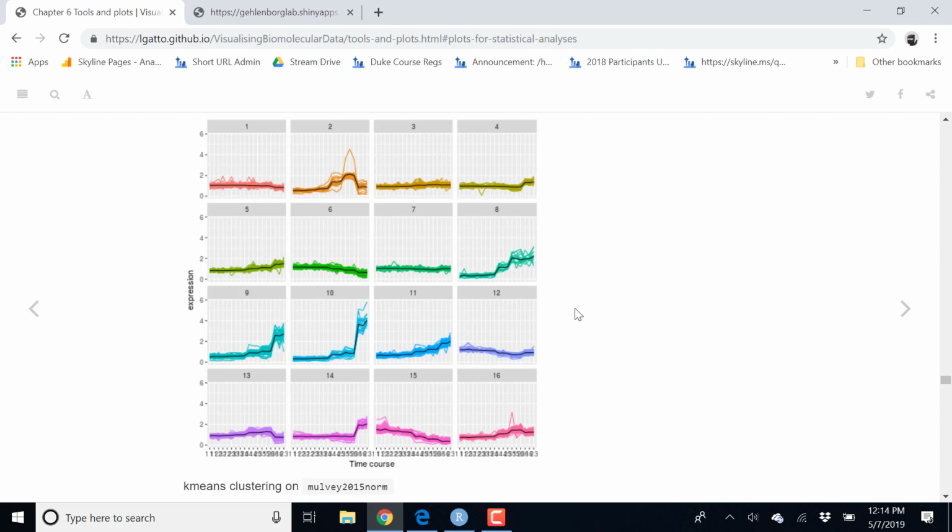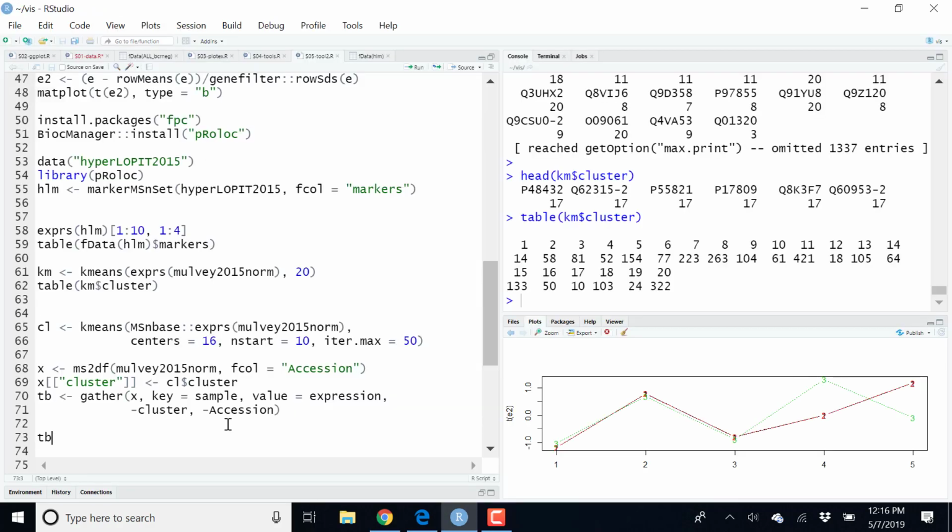But that's very often a tool that has lots of underlying methods under the hood, and is more difficult to tackle. And so the first thing to do is to use plain k-means, get a rough estimation of the number of clusters, and see how k-means performs before moving on to more complicated methods.